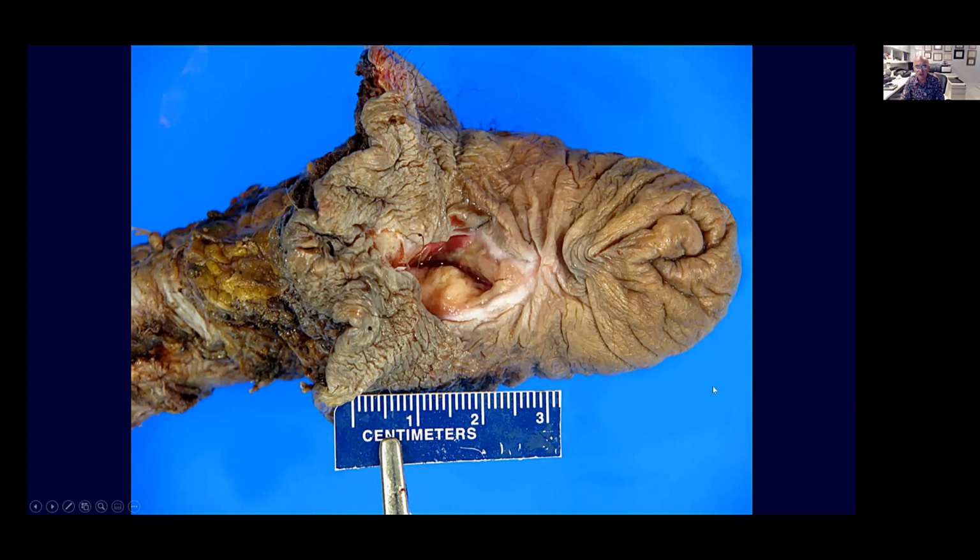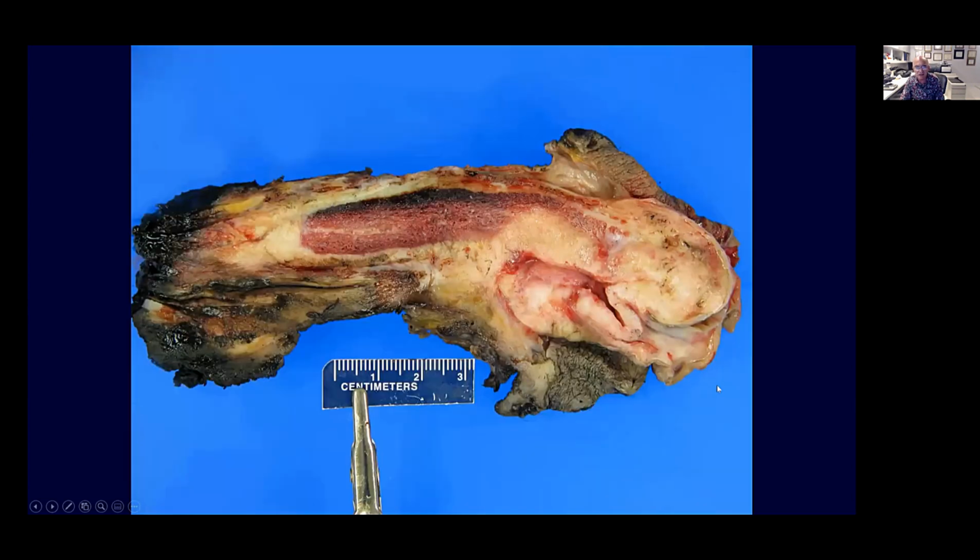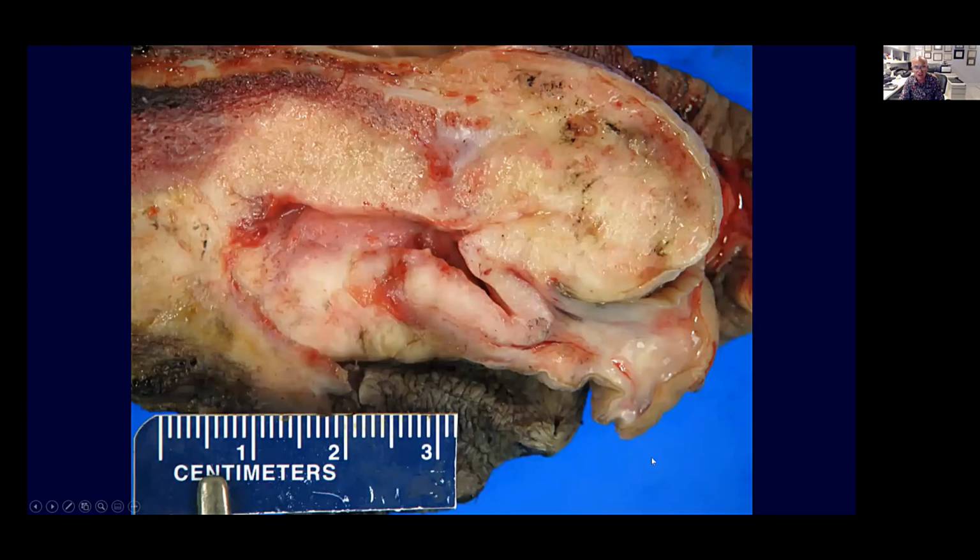It was not an artifact. And then here we have the longitudinal dissection. You can see this tumor that has created this fistula. It also has involvement of the glans penis, and most likely with no evidence in the areas more proximal in the surgical margins.